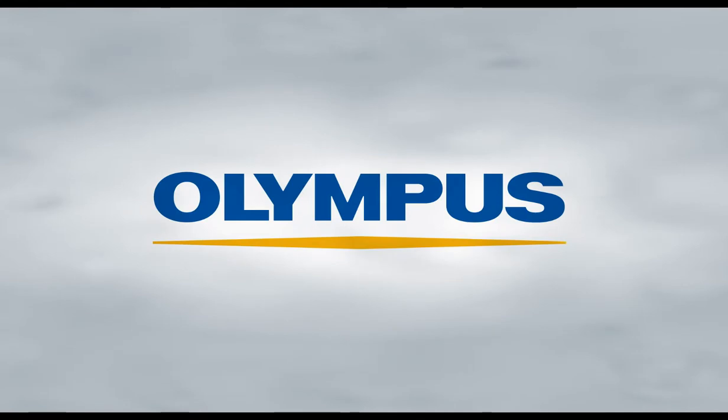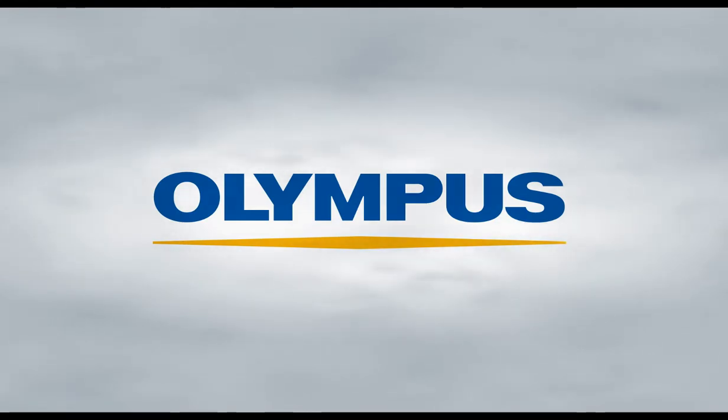This video will show you how to share your Vanta XRF Analyzer screen using the Olympus Scientific Cloud.